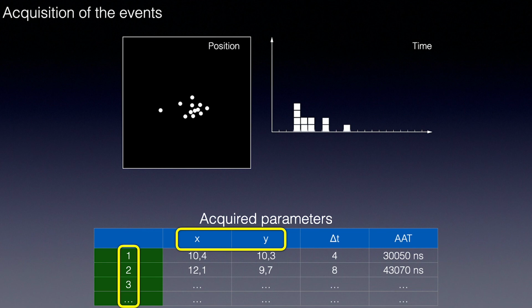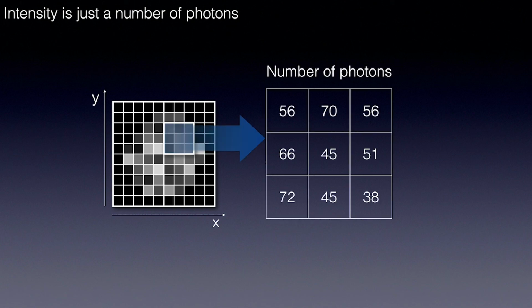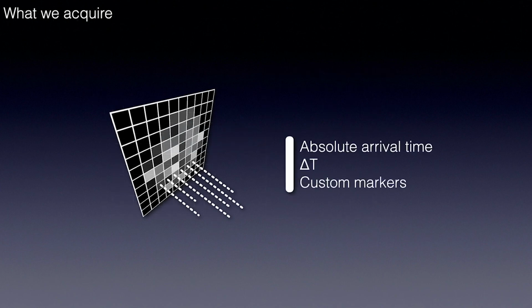But how do we get an image? For this, we just bin the photon positions into two-dimensional histograms, because the intensity is nothing more than a number of photons in that pixel. What happens here is the following. First, we define the pixels by the software. Second, we select a subset of photons to define a frame, and we build a histogram. At the same time, we build a list-like structure related to each positional bin. Thus, we can correlate, for example, timing with any set of markers of the original photons.